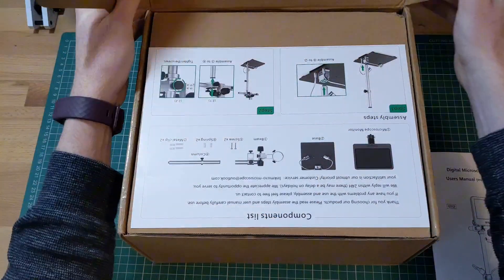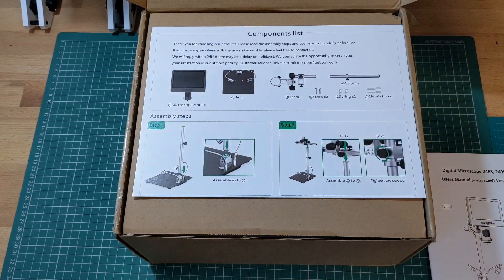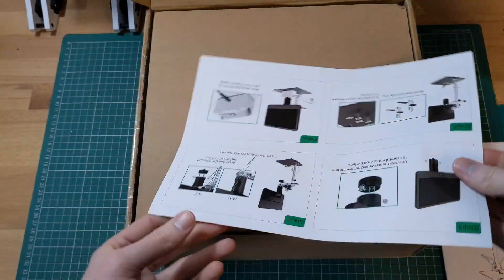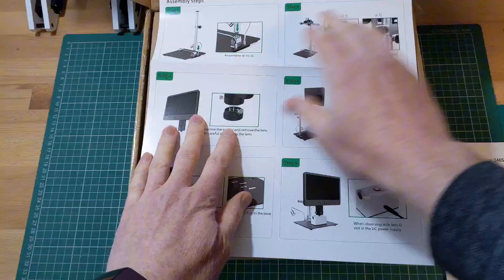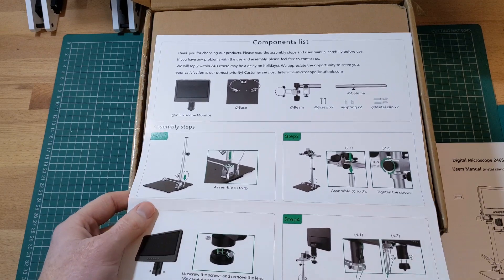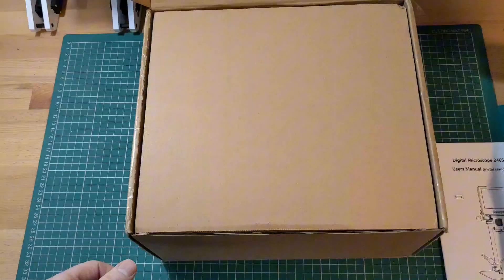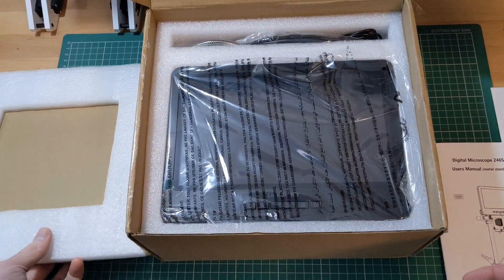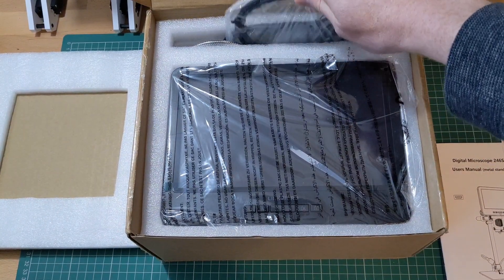The microscope comes in strong packaging, with assembly instructions included in English that are clear and simple to follow. The microscope itself comes well packaged in a sturdy cardboard box with foam and cardboard inserts for protection. The microscope and accessories are well protected and easy to remove from the box.